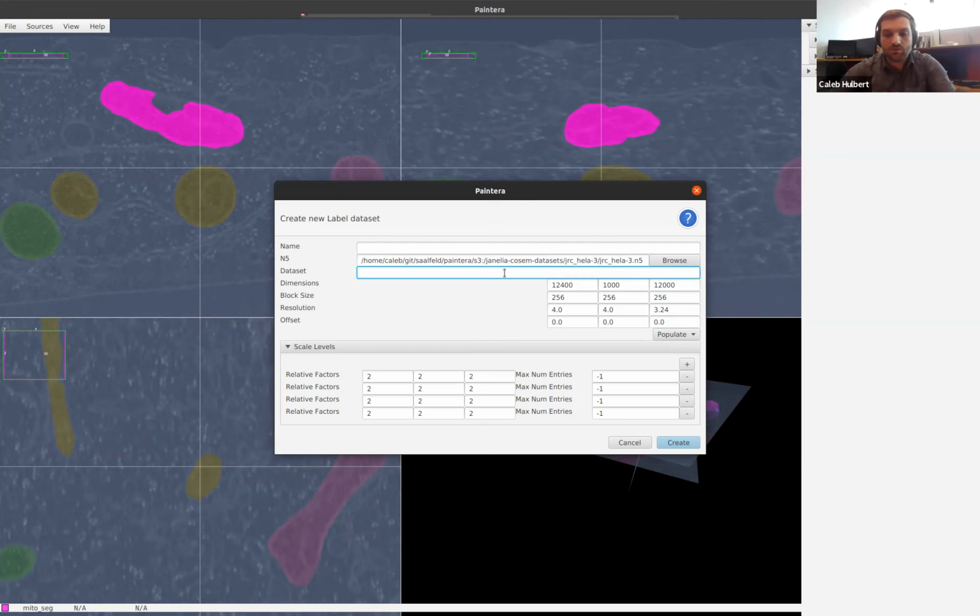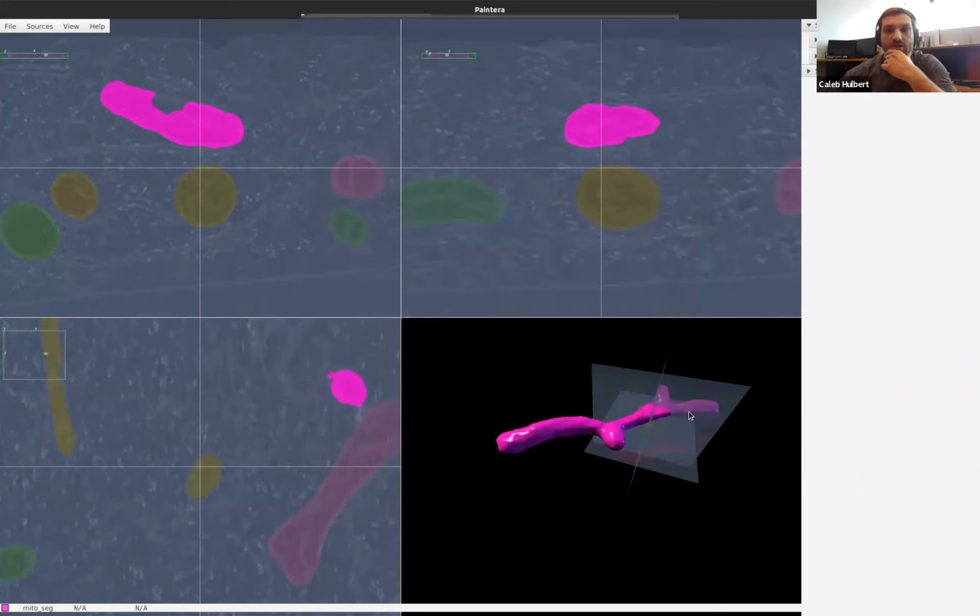And yeah, we can do labels local or something like this, just to indicate that that's where they are. So the scale factors are just the downsampling factors of the different scale levels and their relatives. So, this first one is by 2 in each dimension, by 4, by 8, so on and so forth. Okay, so we can create this.